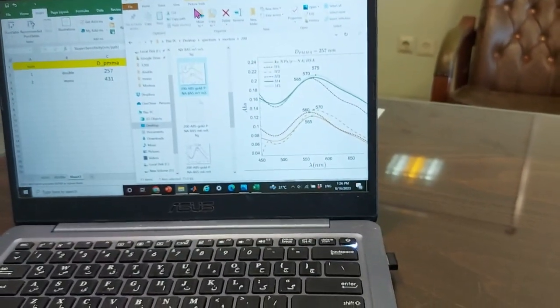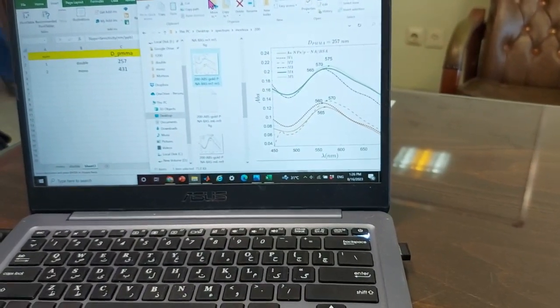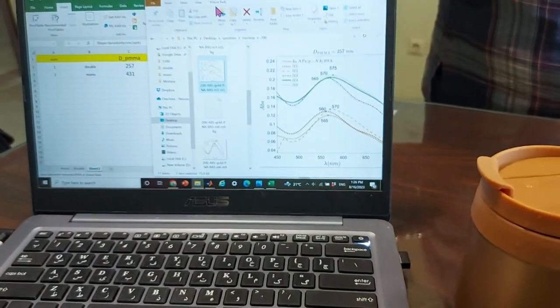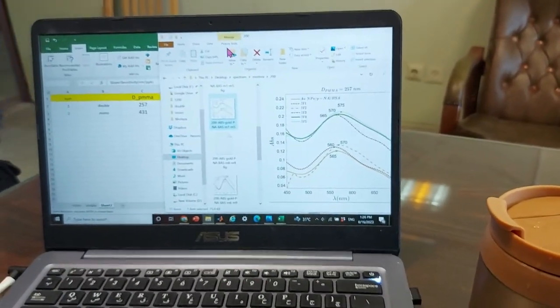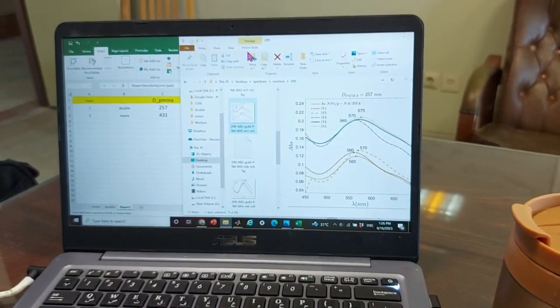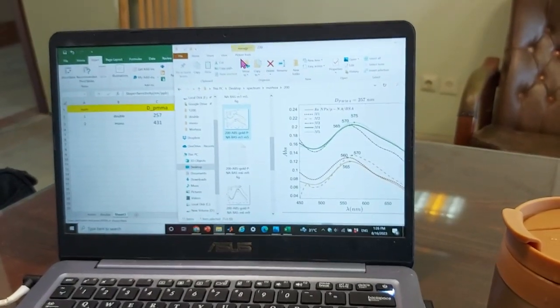Doctor, what is the limit of this thickness? It depends on the machine that we are using for magnetron sputtering. The lowest thickness that this machine can deposit is around 2 nanometers. But it is so low, because the amount of gold is so low.